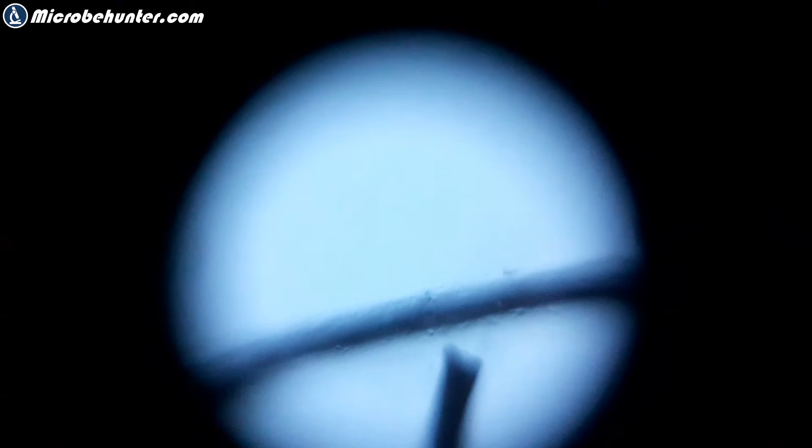Yeah, here, that's here. That's my hair. Yeah, you can see it's a little bit difficult, actually. I had to, of course, center the slide as well. At the same time, I had to find the right focus and the right distance. But, yeah, it did kind of work. It's a little bit fuzzy because of the plastic or of the slide, because it's tape. This is how it looks like. You can see on the left side, this is the light lamp that was provided. And then it's projected on the wall.